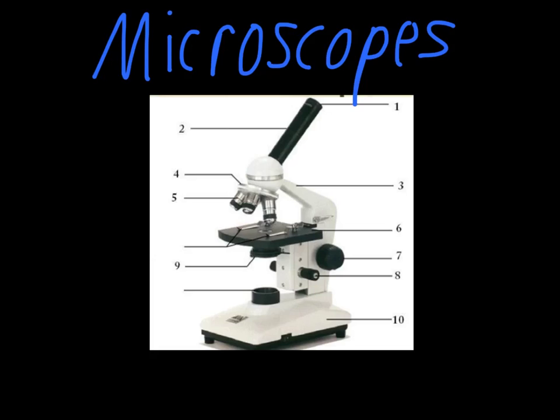The things that move the stage up and down are these two knobs on the side of the microscope. The coarse adjustment knob moves the stage significantly and should only be used when the lowest power objective is in place, when you have the 40x lens in place. The smaller knob over here is the fine adjustment knob. This moves the stage very, very slightly, and that's what you should use when you have the 100 and the 400x lenses in place.